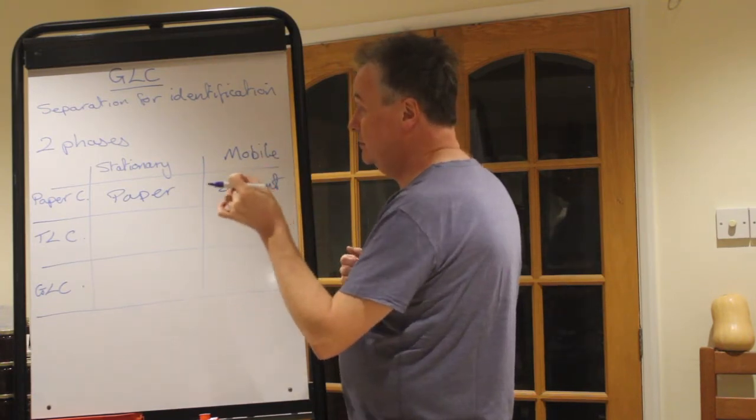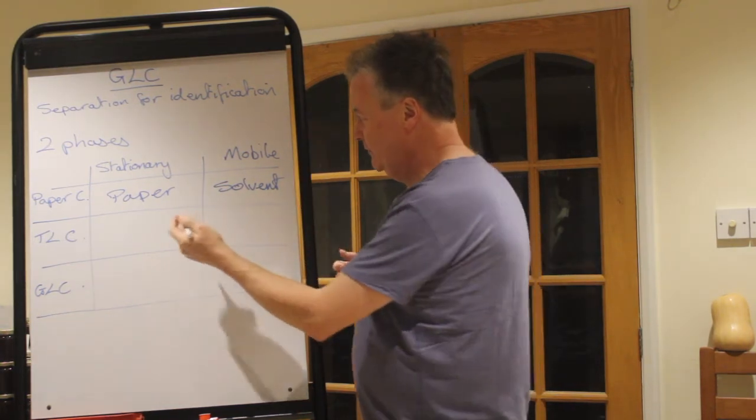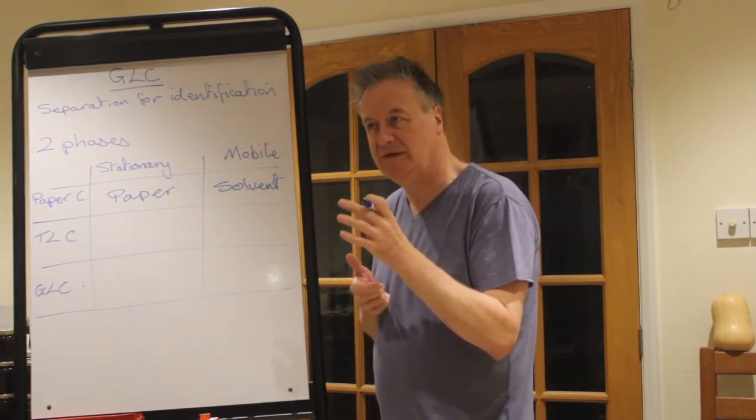Now TLC, very similar. It's a plastic plate, and they vary in size depending on where you bought them from, but they can be up to 10 centimetres.